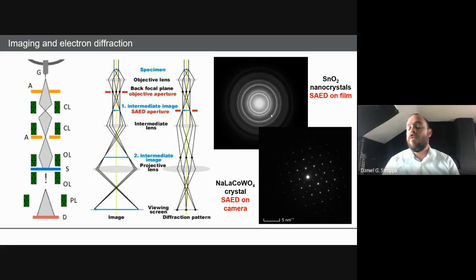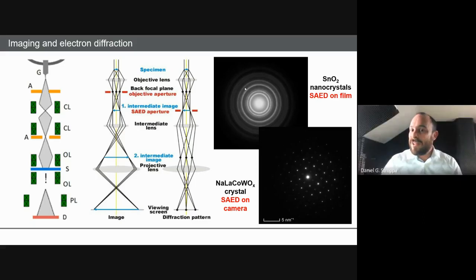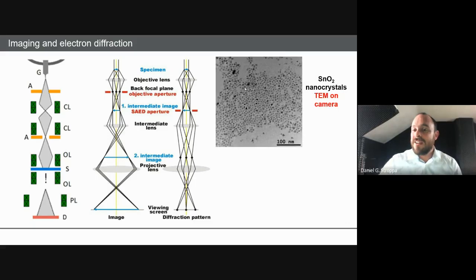Yeah, it's a bit of an abstract concept, but imagine here, if we take any of those small particles and we take the diffraction pattern of those individual particles, they are going to look like monocrystals. They are going to have certain scattering angles depending on the orientation of the sample. Some crystalline planes will be in diffraction condition, and each one of the particles is going to have one pattern like that. But then when you add all those patterns together, you're going to get an averaging effect. I hope that makes it a bit more clear.